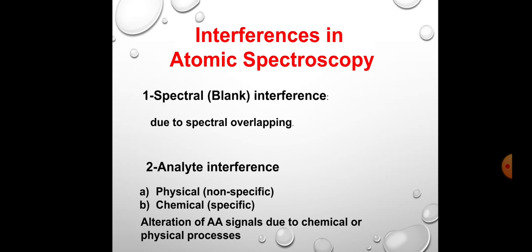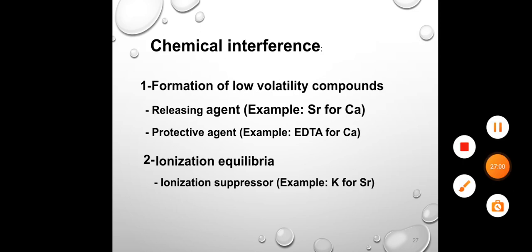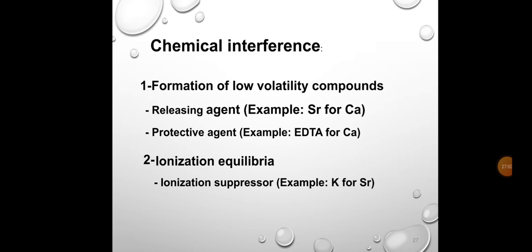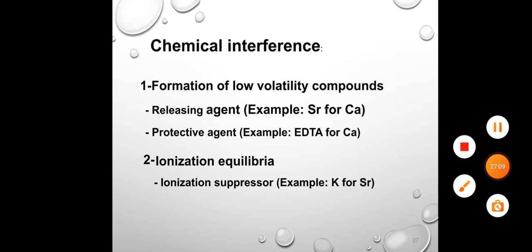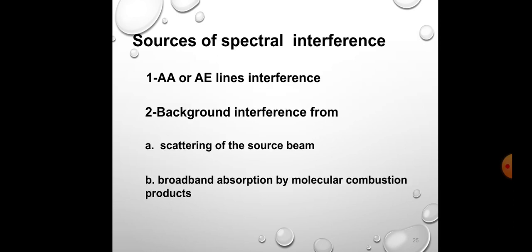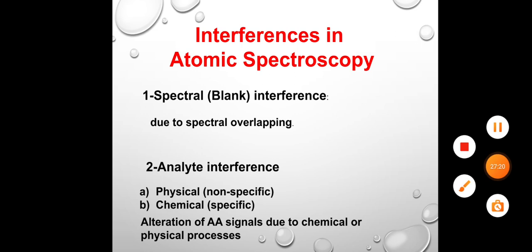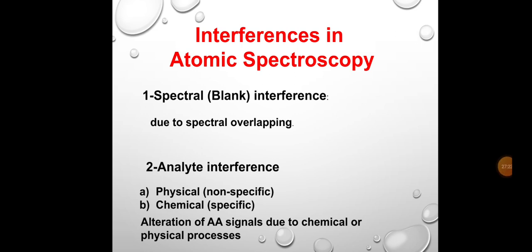Okay, and then we will talk about interferences in atomic spectroscopy. Let me stop here and record the other slides in another file, because I think this file will be too large otherwise. So interferences in atomic spectroscopy will be discussed in the next file. Okay.